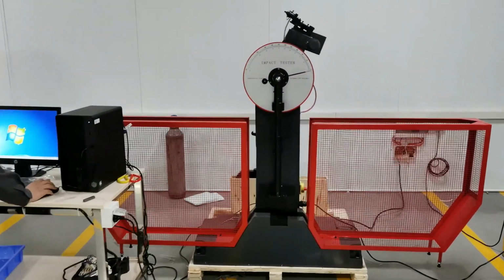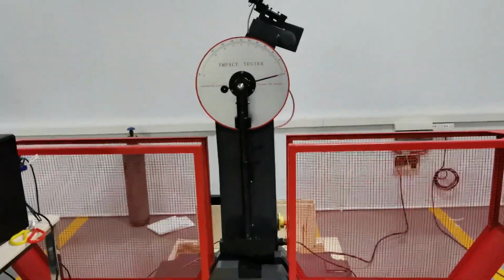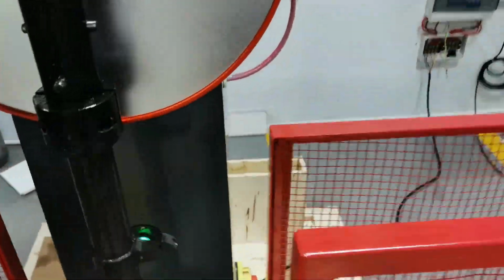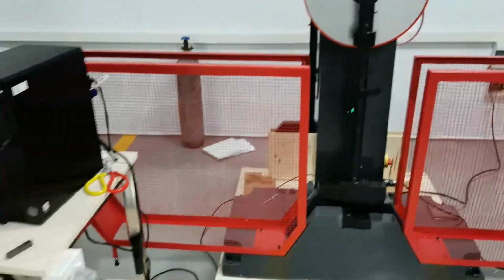This is Andy. Now let's talk about how to operate the impact test. Okay, first we have to open the power, right? And this is the power switch. And then we have to open the software.